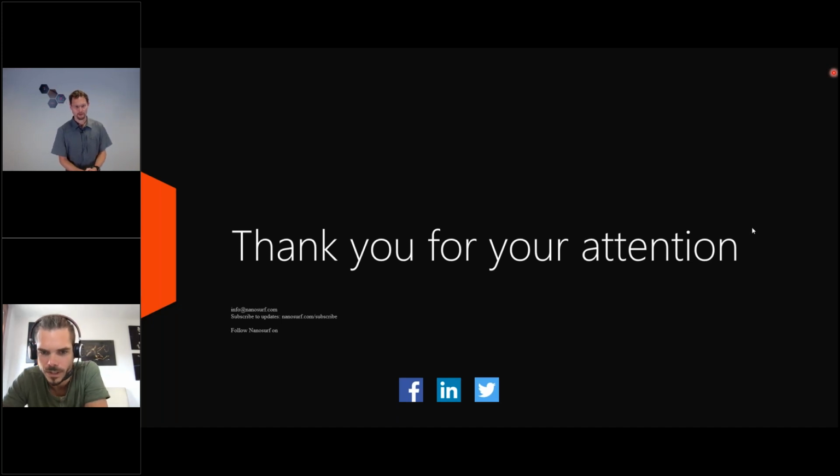Moving on. How do we choose the AC excitation bias to get the PFM response? What precautions should we take to choose the excitation bias and also the resonance frequency? So that's a few questions. Can you do it in 3 minutes?